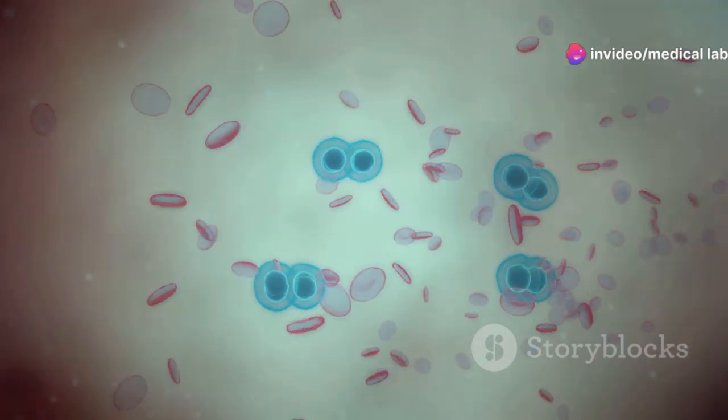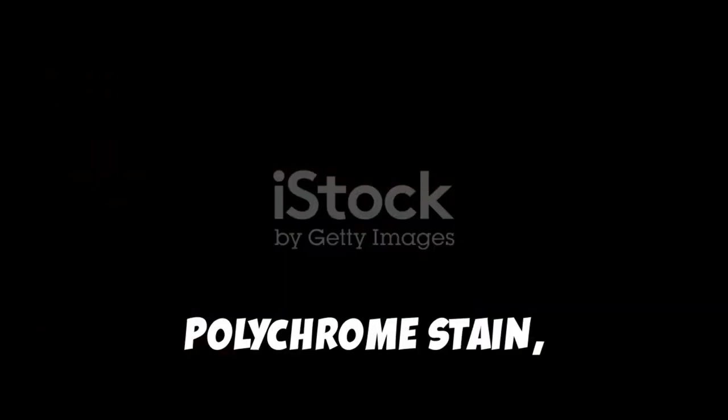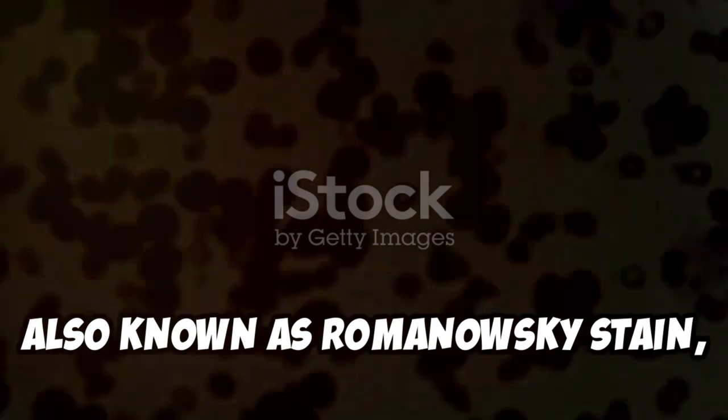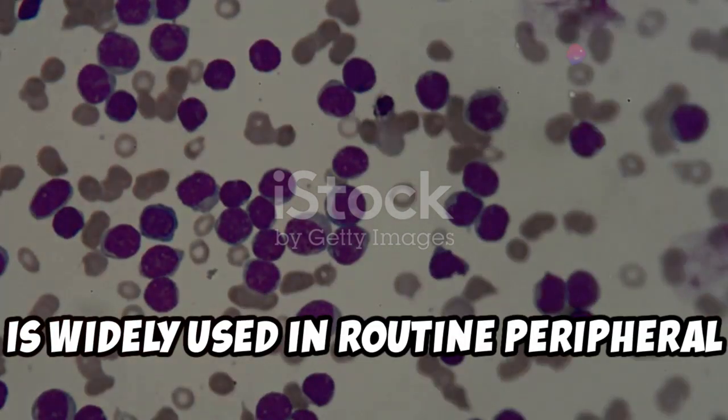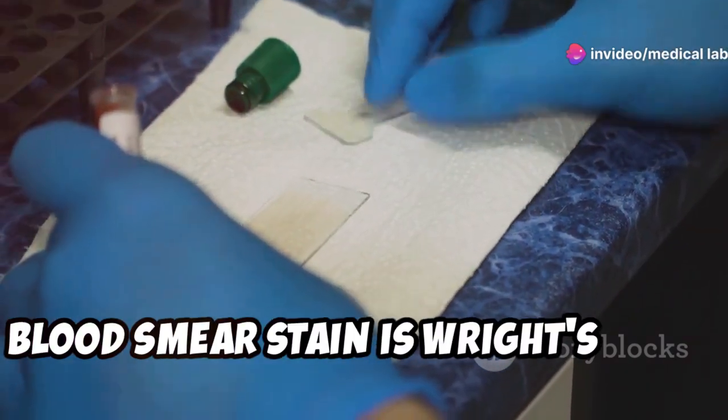Hematology stains. Non-vital or dead cell polychrome stain, also known as Romanowsky stain, is widely used in routine peripheral blood smears. Most commonly used routine peripheral blood smear stain is Wright stain.